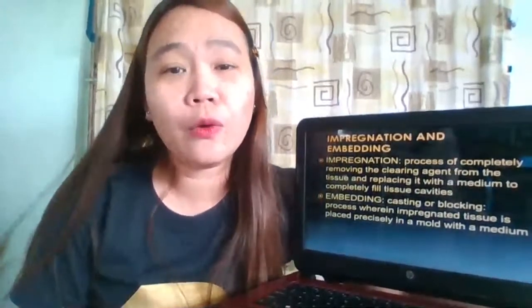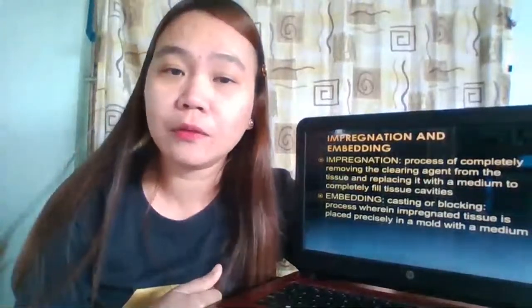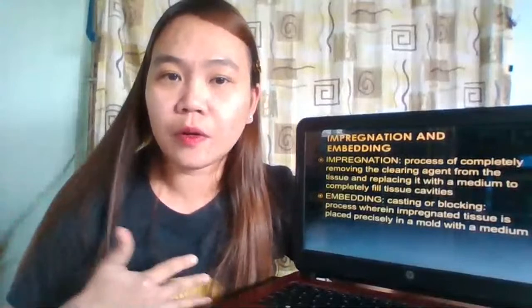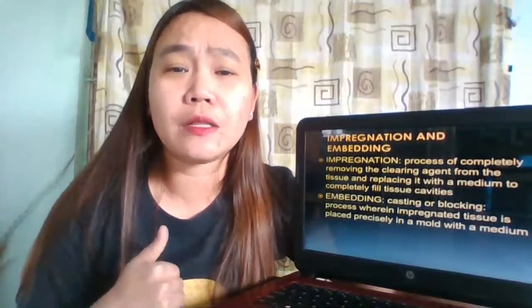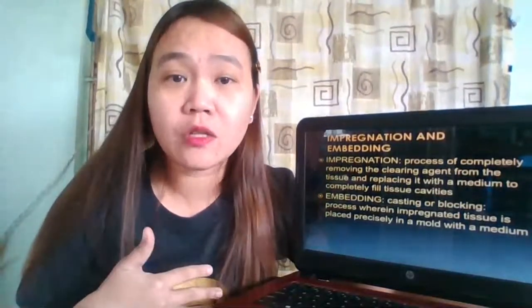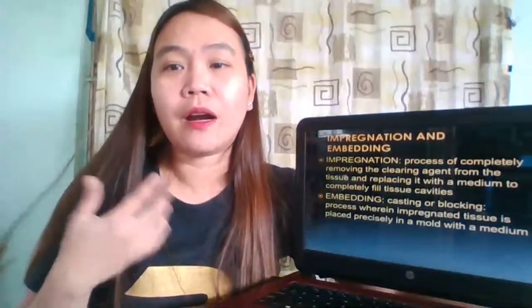Okay, so for this video, we will be discussing two processes, or two steps rather, in tissue processing. That would be impregnation, and then the other one would be embedding. After performing clearing, the next step in the routine tissue processing that we perform in histopathology would be infiltration and embedding. The reason why we are discussing them together is because the reagent used in impregnation is most oftentimes the same reagent that we use for embedding.